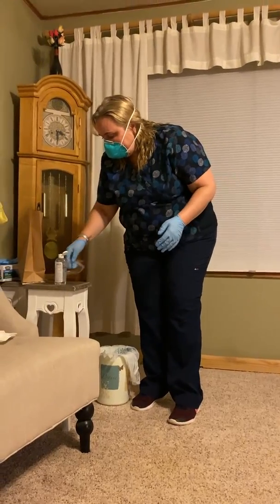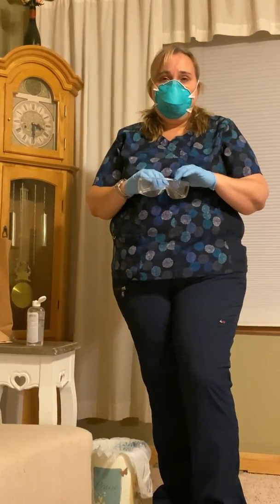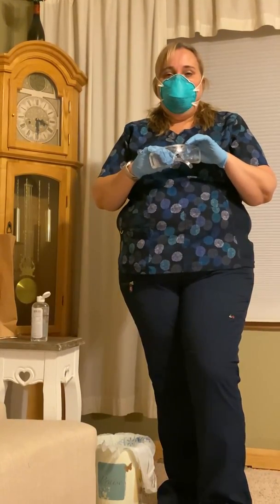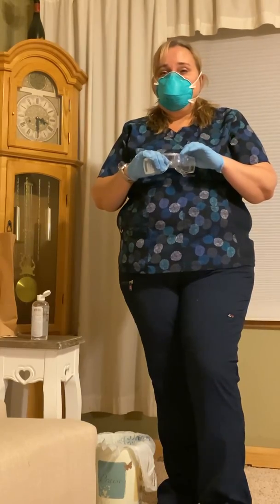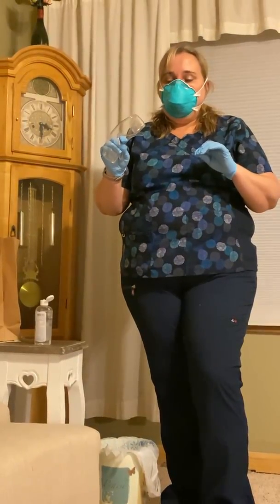So there's a couple choices. We have goggles that can be cleaned. Our current process is following the CDC's guidance that when we are done using them, we will take these goggles to the dirty utility room, and there is a bin there to put them in. Central Supply has specific directions on how to clean these. We want to avoid using the purple wipes or the gold wipes on the inside of these, because that is a very strong disinfectant. It is really not meant for anything that is going to touch your skin. So the preferred thing to do is to use them once, put them in the dirty bin in the dirty utility room, and then they will be properly cleaned by Central Supply. So I'm going to don this eye protection.